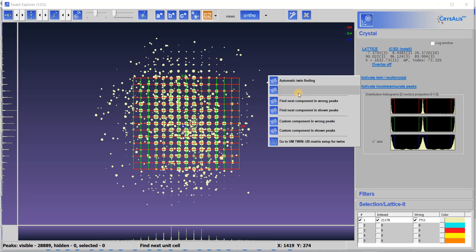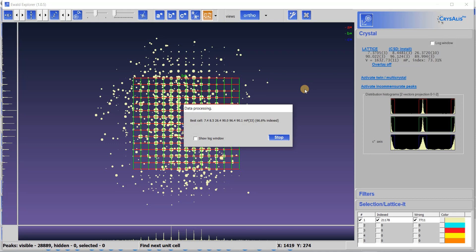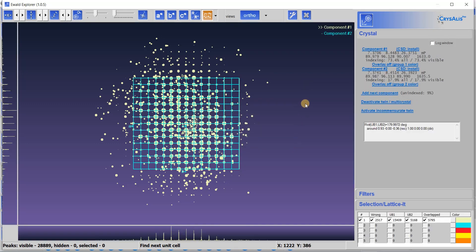Press it and you will find a number of options: automatic twin finding, custom twin, multi-crystal finding, and so on. I am using the first one — Automatic Twin Finding. The option you choose depends on the type of problem, so let's first try with automatic twin finding. It will find the next component. The results show approximately 73.4% for the first domain, approximately 18% for the second domain, and 9% are still unindexed.